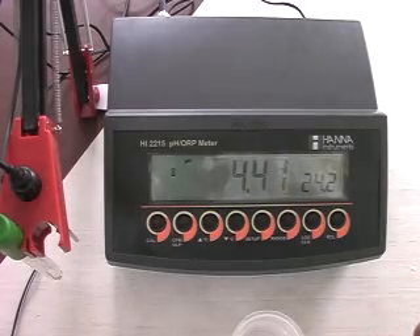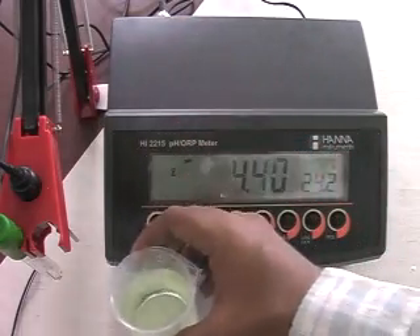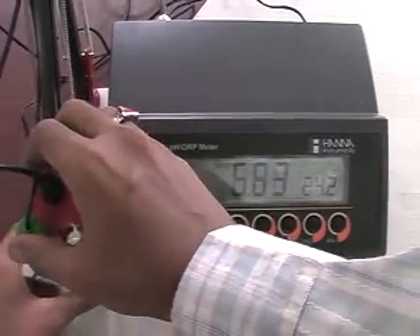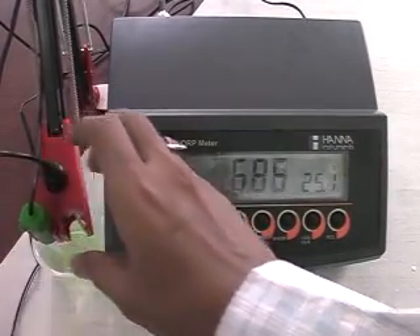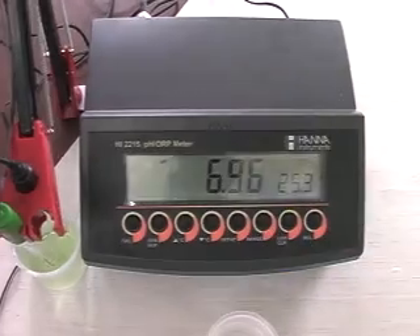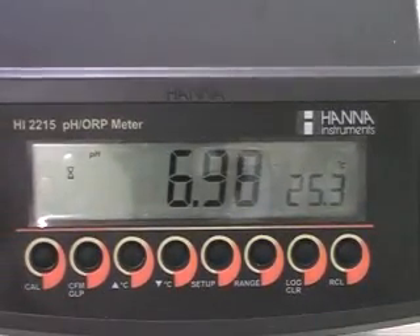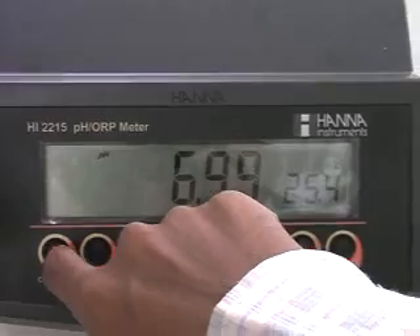Then submerge the pH electrode and temperature probe into the 7 pH buffer solution. The temperature probe should be close to the pH electrode. Now, press the CAL key to enter into the calibration mode.